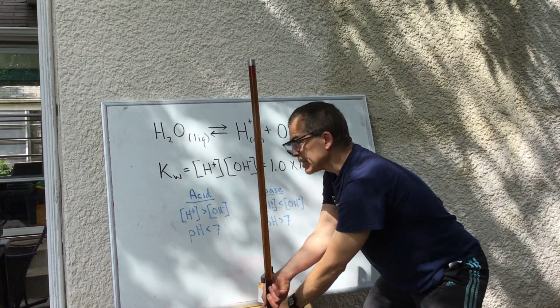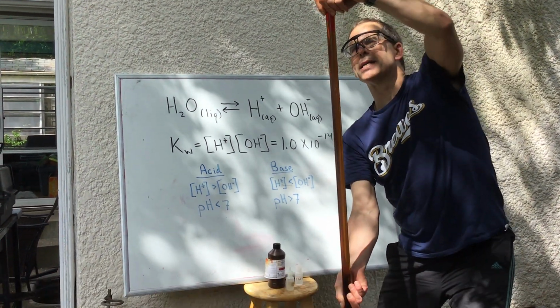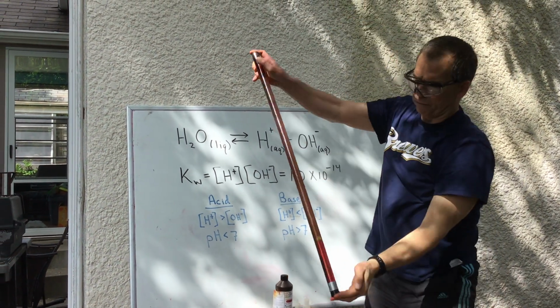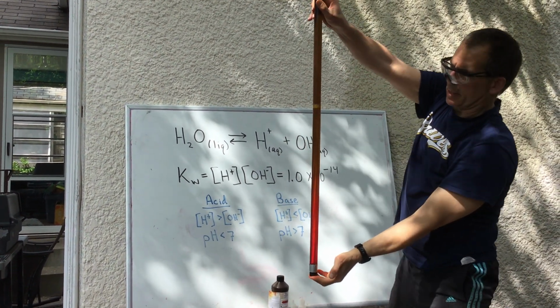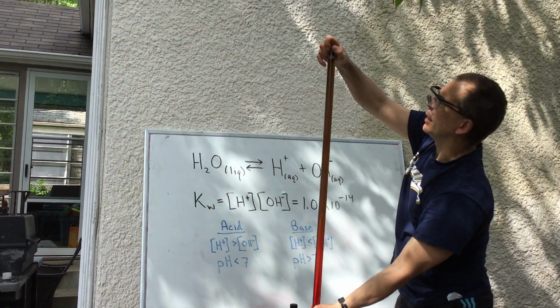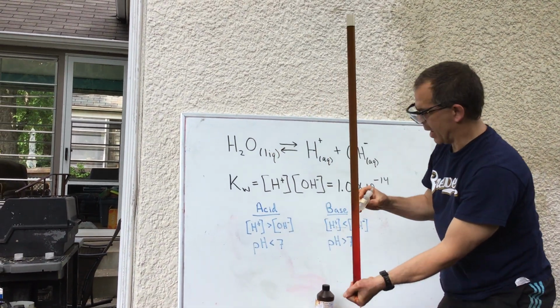Okay, and we can see what's happening to the color there. At least to me, I can see it's getting red up on top inside of this yellow. I put this cap on and flip this over. You can kind of see the red climbing up through the bottom. There goes the air bubble through it. And I'm going to take this top off. Hopefully it's not going to leak too bad from the bottom for me.